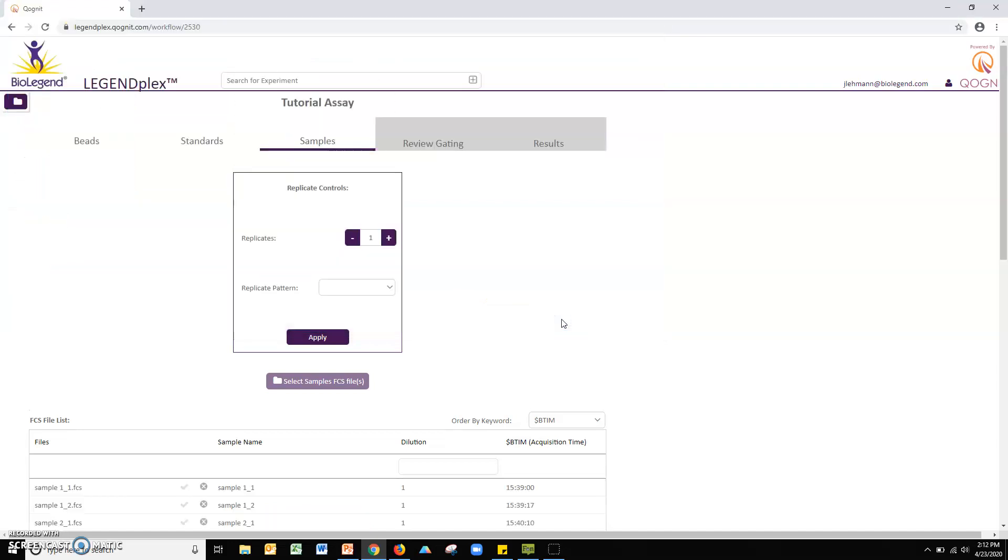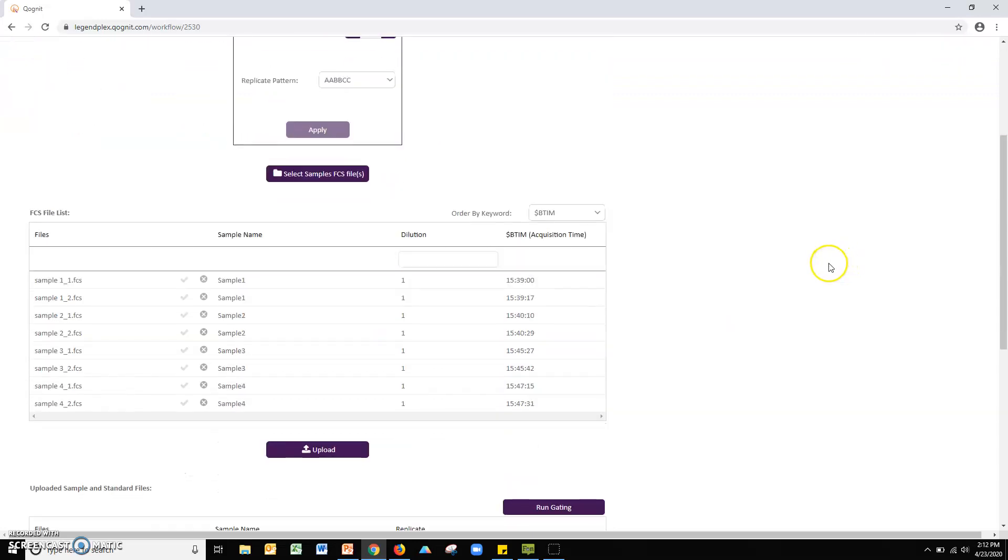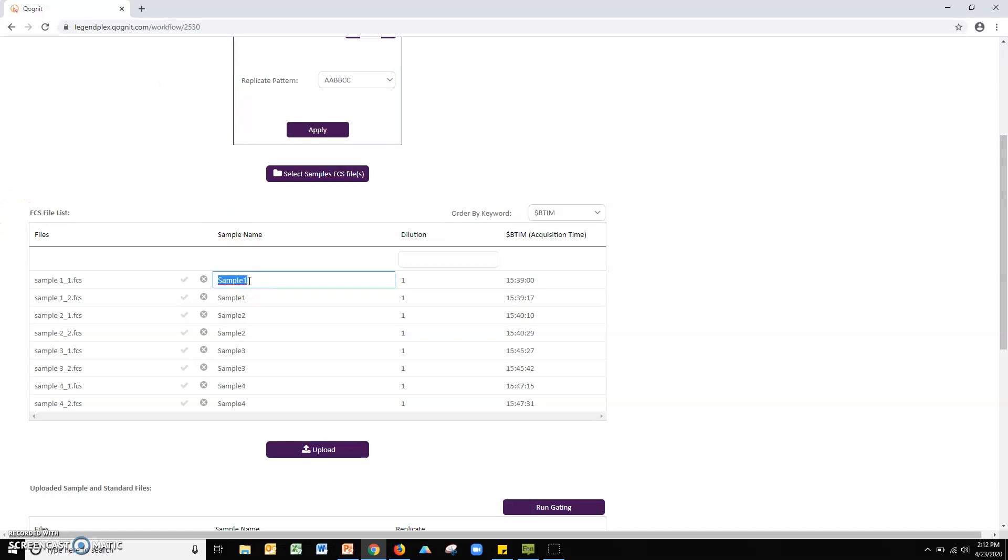Should you wish to define samples as replicates of one another, please complete the following steps. Adjust the parameters in the replicates control box to match your assay files and then click apply. This will apply the replicate control settings to your sample files. Note, the sample name field is entirely editable should you wish to rename your samples beyond the default provided by the software. All files with the same name field will be treated as replicates by the software.